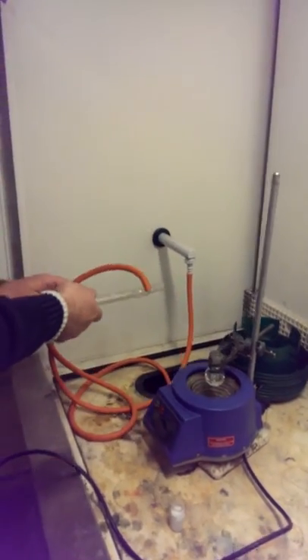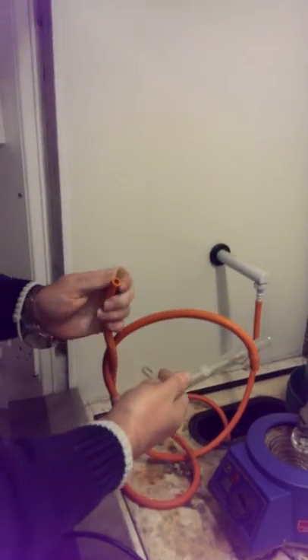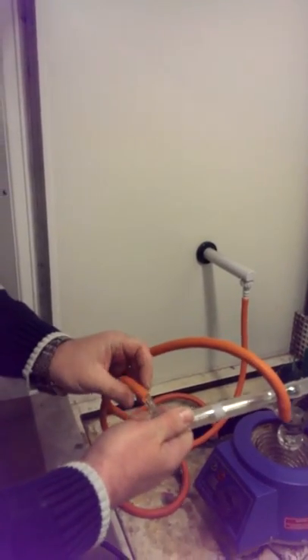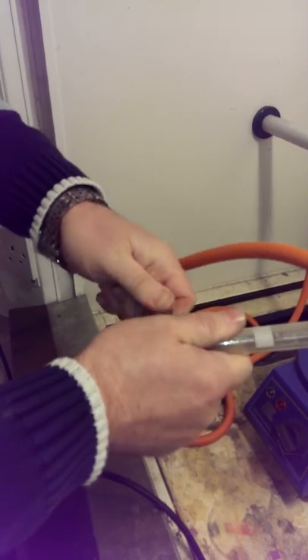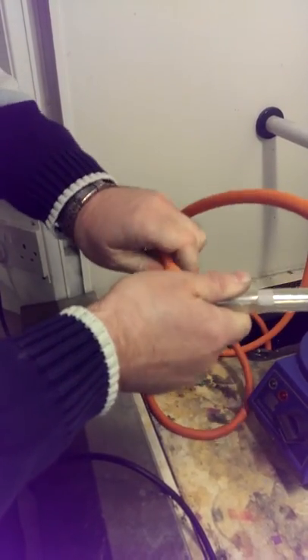Just to give you some advice about tubing, how to put the tubing on. So we have water in at the bottom, water out at the top, down into the sink. Whenever you're putting tubing onto glassware, wet the end of the tubing and put it on with a twist. So it goes on with a twist, like that.